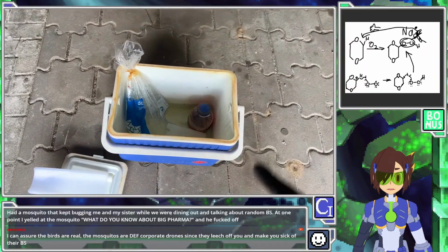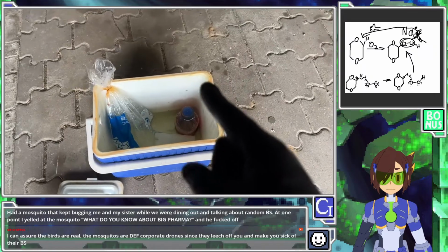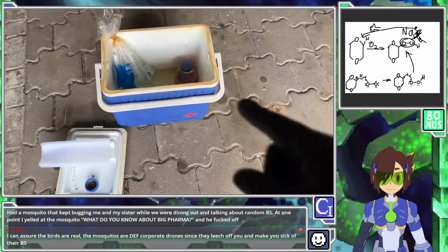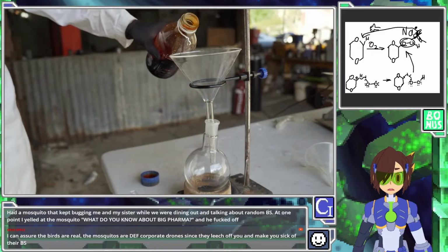All right, actual bromine chemistry. Not particularly pleasant to be around in real life. It's only me that has to suffer through actually being here. So. Oh, but yeah, no, the bromine distillation is dreadful.